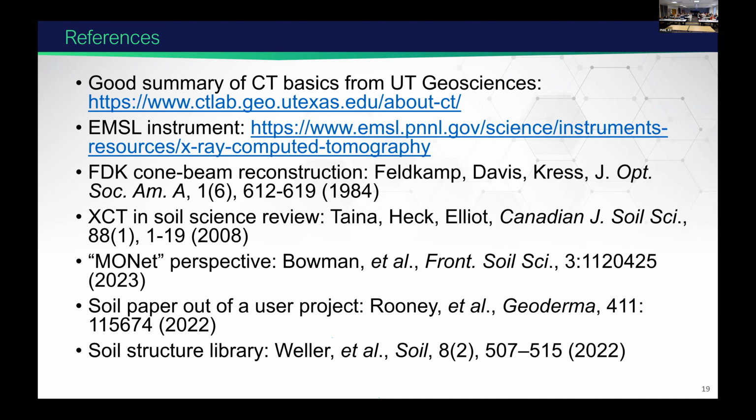Recently, we published a MONet perspective in Frontiers in Soil Science, which I recommend you to read. One year earlier, we published a paper that contained Avizo-based soil pore network analysis in Geoderma on permafrost soils that shows some of the analysis that we do for MONet and more, such as pore throat sizes and pore coordination numbers. And then this European paper, a recent paper of a soil structure library, is also a good read, showing a wide range of soil parameters derived from XCT.